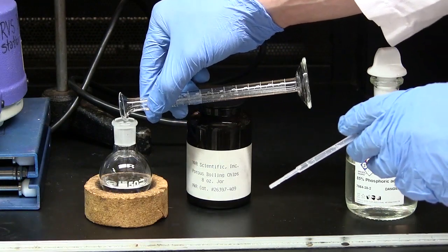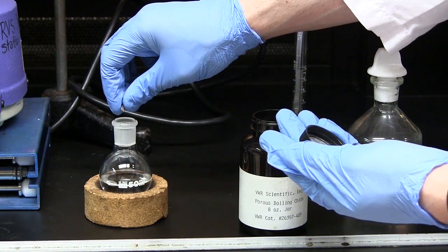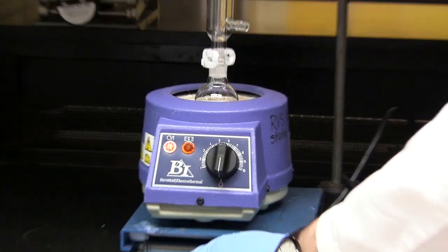Add 5 mls of concentrated phosphoric acid and boiling chips. Clamp the flask into a heating mantle.